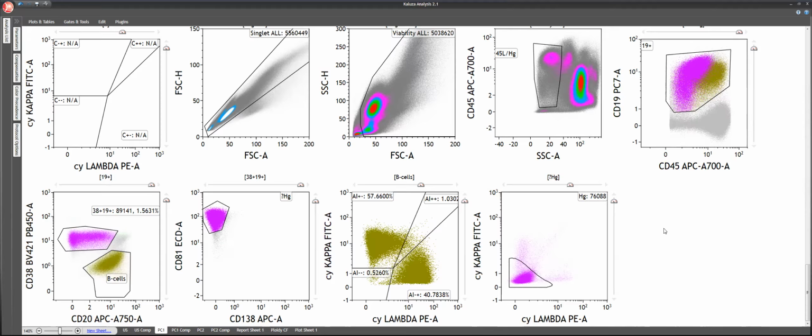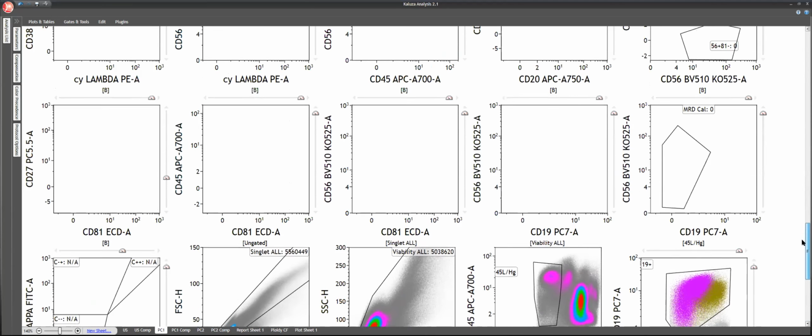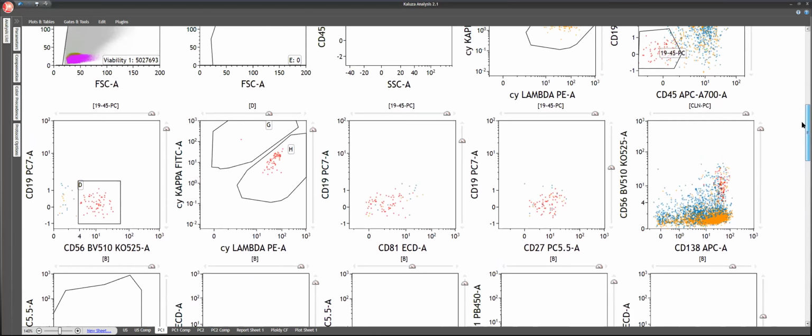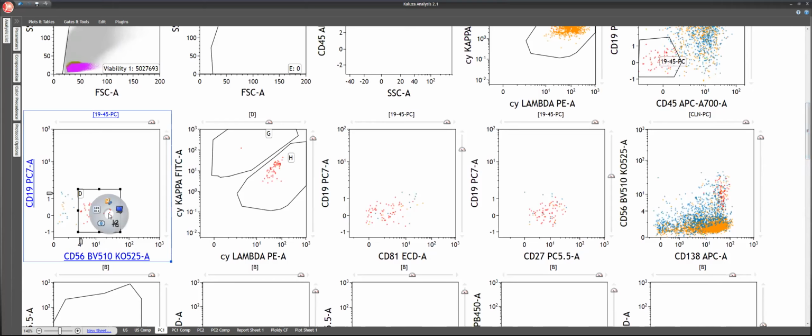There is no hemodilution. In this tube there is no CD117, so we cannot look at mast cells, and CD117 to mature cells. And these are the cells. So let's see how many events there were. If you look at this, we can label it as minimal residual disease because they all are restricted and show abnormal antigen expression.